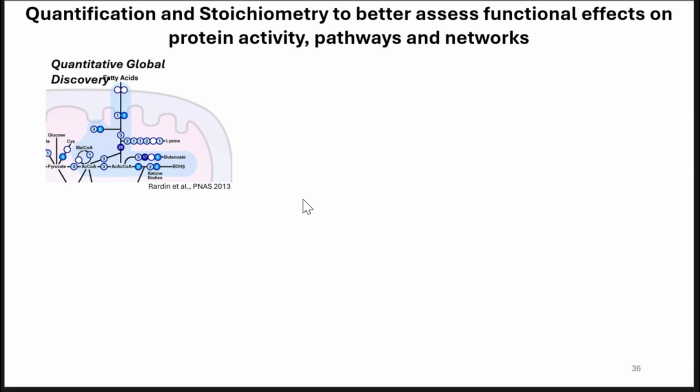So it's not a protein level quantification. It has to really be quantification on the peptide level on each specific peptide that contains post-translational modification. And sometimes you may have a multiplicity where one peptide can have 3 or 2 PTMs. So then the whole quantification gets also complicated, and Spectronaut has really been able to kind of decipher these things.